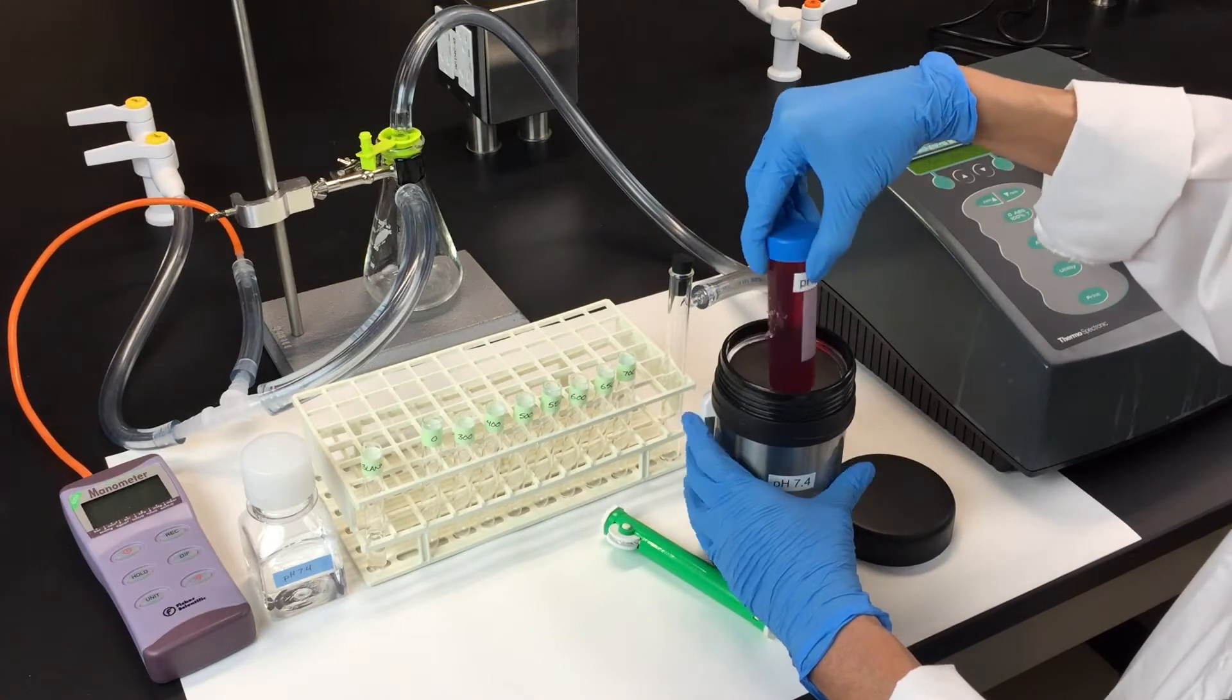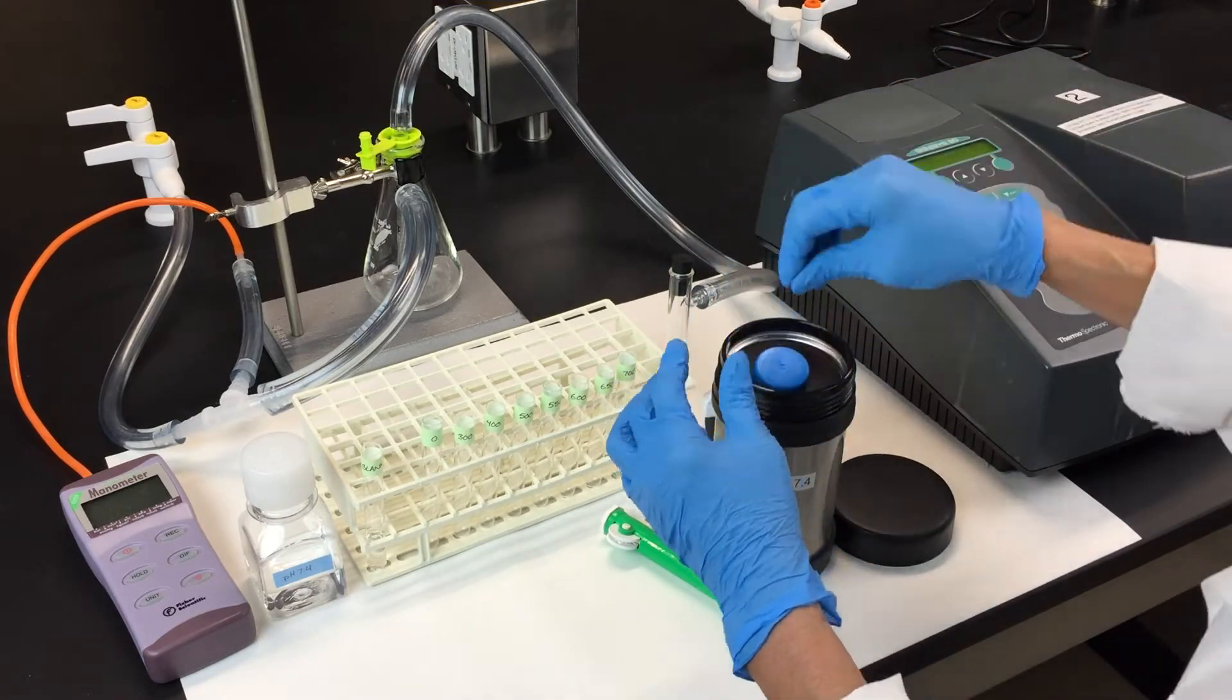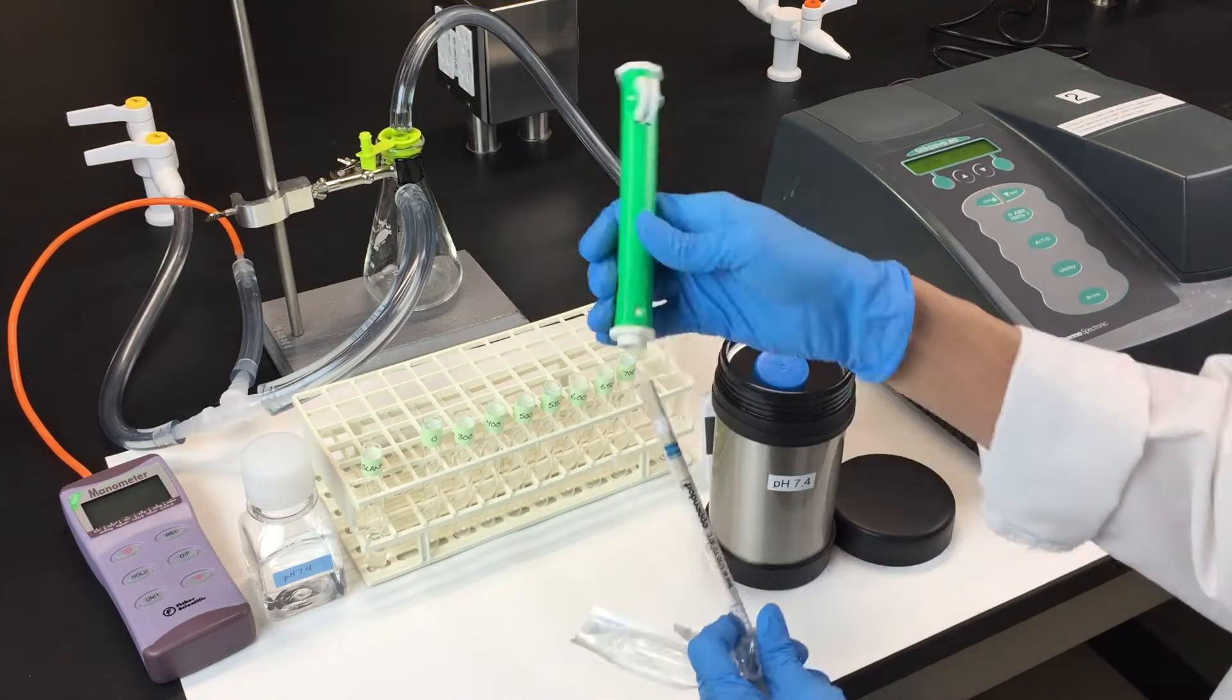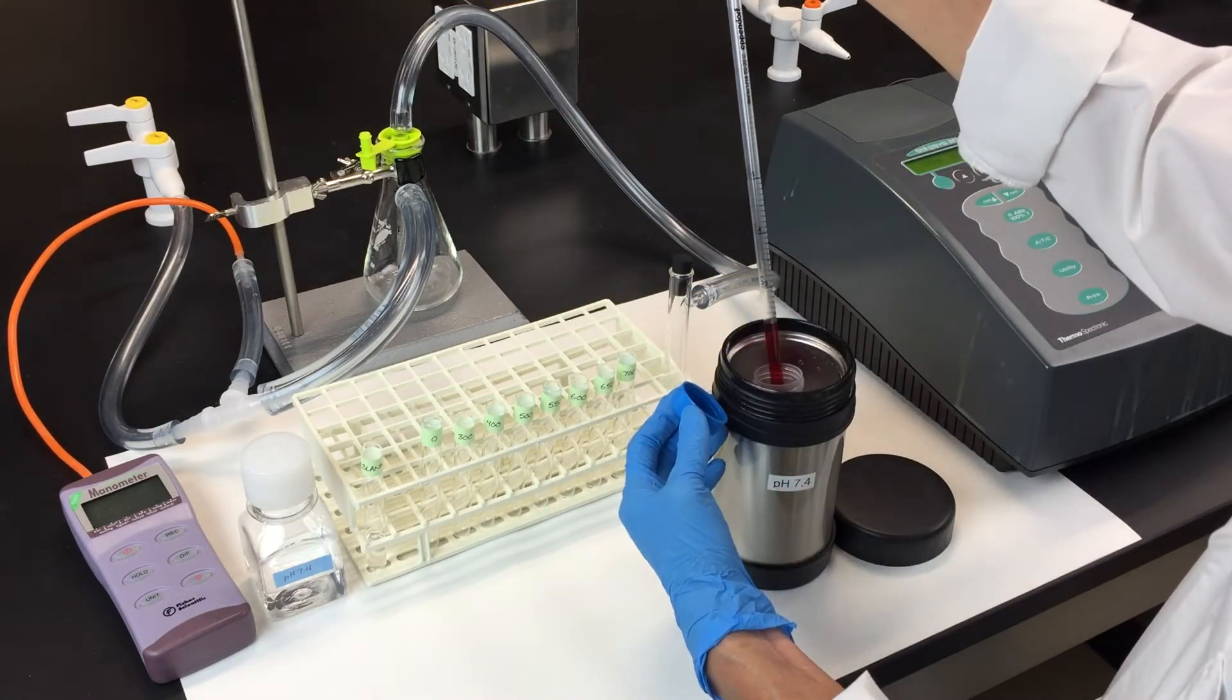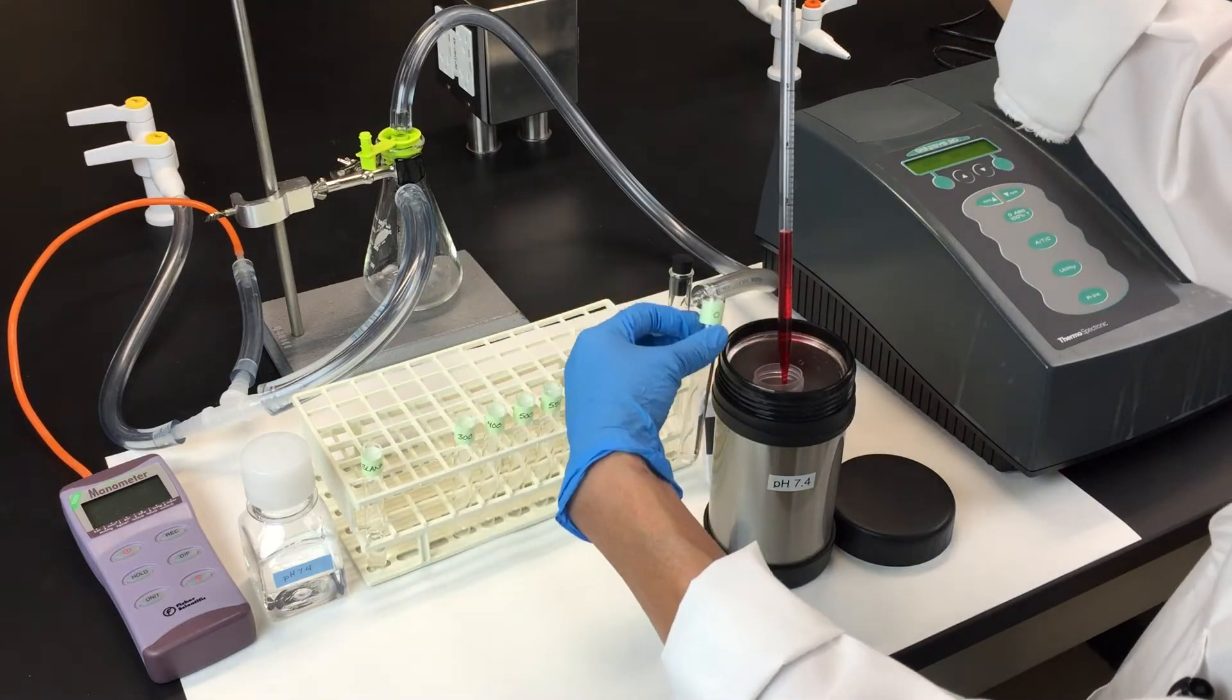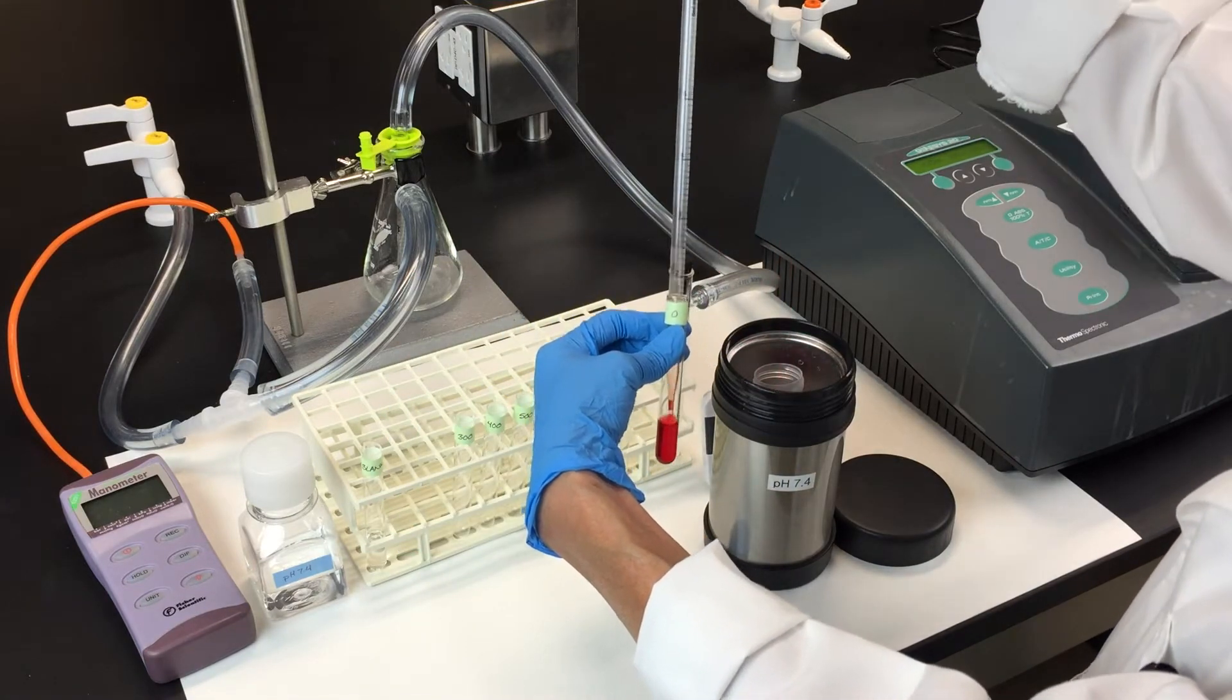Transfer 2.5 milliliters of the hemolysate to the 0 millimeter mercury tube and let it warm up before you place it in the spectrophotometer. This will help prevent any condensation that could collect on the outside of the tube, which could interfere with your readings.